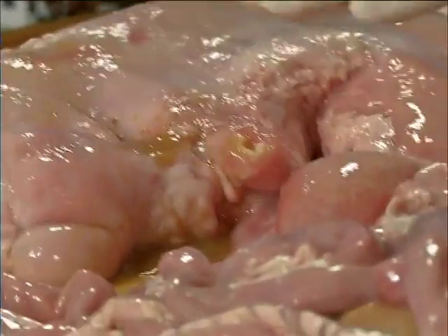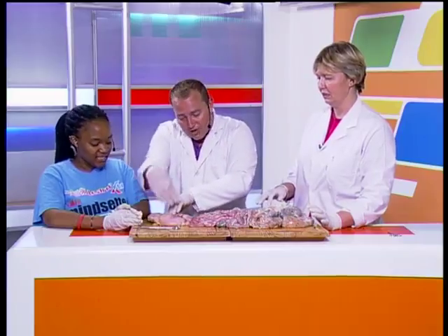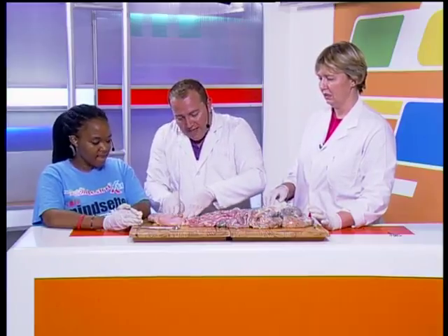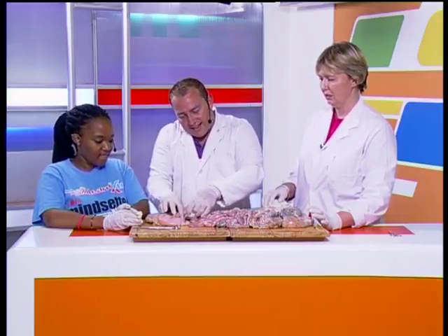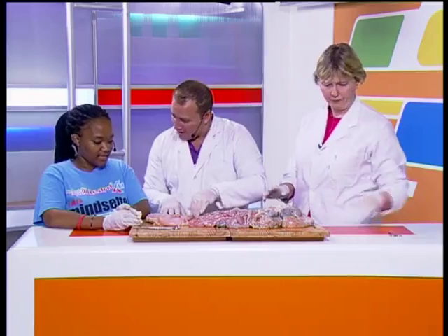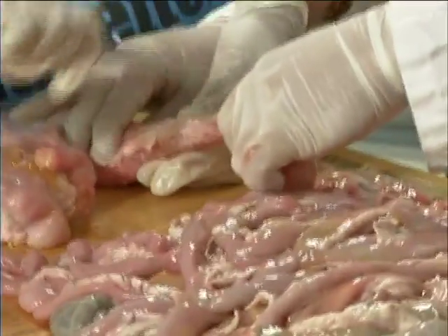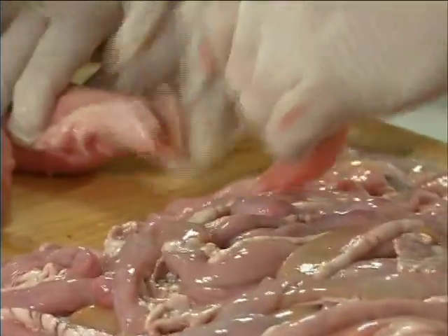I did promise Luni that Luni can actually cut it. But before we cut it, Luni, the food goes in here, the stomach does its work, and then it gets sent out again. So I'm going to cut the stomach off completely. It goes into the small intestine. Can you remember? Okay, so cut that for me, like this. Watch your fingers. We don't want to go to the hospital.